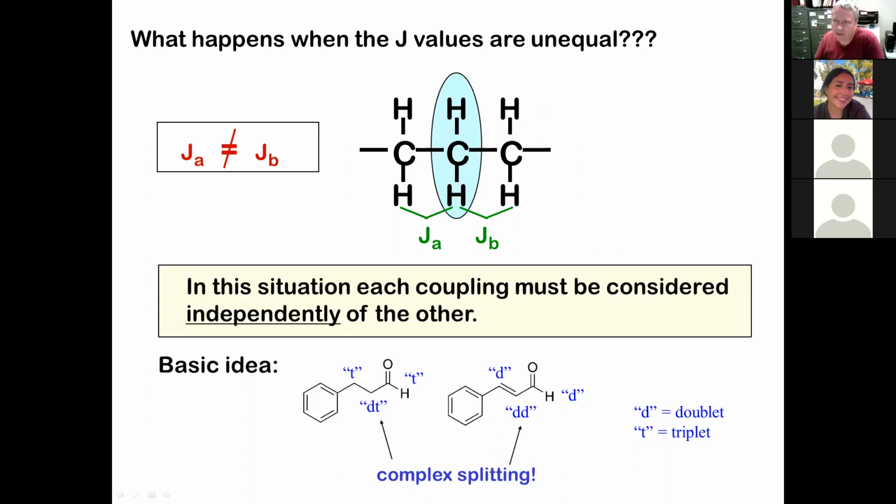I think the next thing will be carbon NMR, so a little different than proton NMR. And then we're going to do the really fun thing of, here's a spectrum, figure out the molecule. It's a really cool puzzle type problem. Okay, I'm going to stop sharing, and I'll keep recording in case there are any questions.